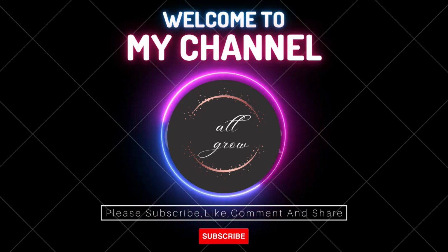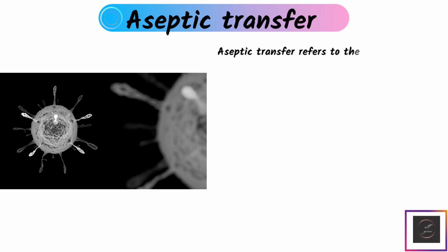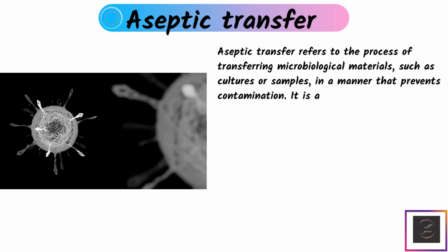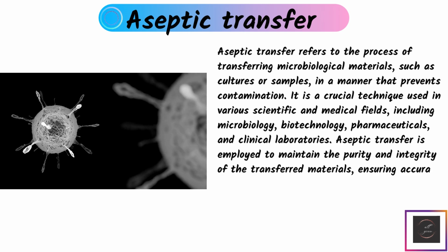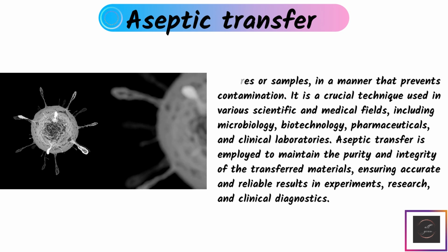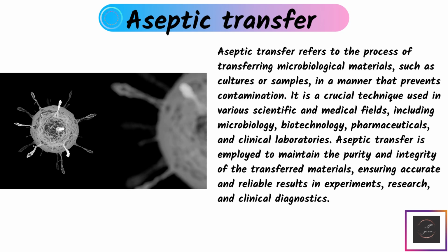In today's video, we will be going to discuss the topic aseptic transfer. Aseptic transfer refers to the process of transferring microbiological material such as culture or sample in a manner that prevents contamination. It is a crucial technique used in various scientific and medical fields, including microbiology and biotechnology.